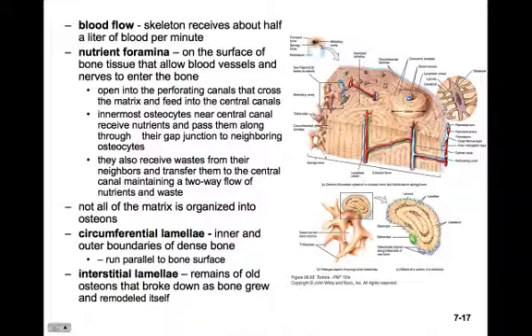The osteocytes, you can see here, live in these little lacunae, as we said. So you can see the outline of the lacunae here, and then a cell, the lighter brown colored structure inside the little lake. And it has lots of little projections. These projections go out through the canaliculi so that each cell can communicate with the neighboring cells.